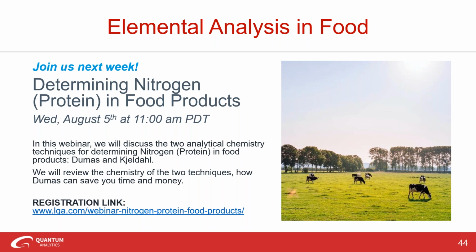And they may even get some spot checks where someone comes out and checks to make sure they're following safety regulations, that they require to have dosimetry to ensure that they're not being exposed to X-ray radiation and so on. So the good sources are, if you Google radioactive safety commission and then enter your state, you'll get right to where you need to go and what you need to do.